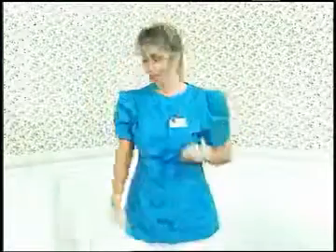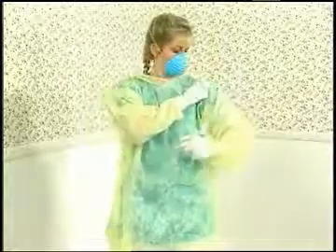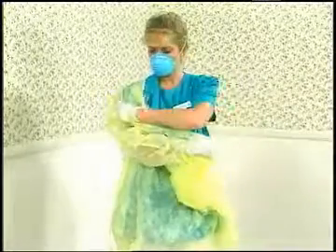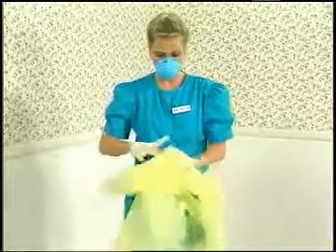Then remove the mask. If large amounts of blood or infectious material are on the gown, remove the gown with your gloves on. Remove the gloves after the gown has been disposed of and before removing your mask.